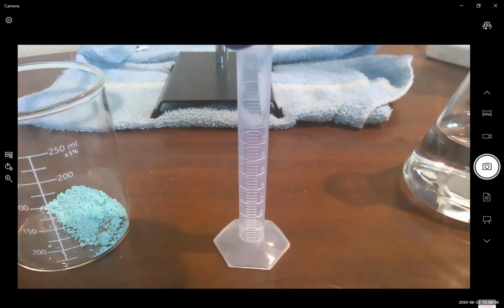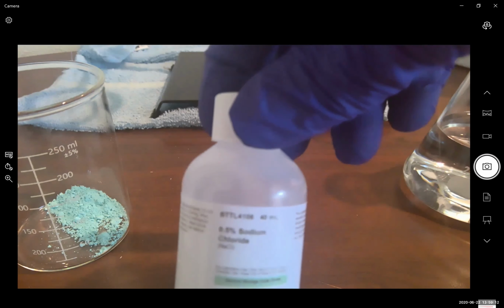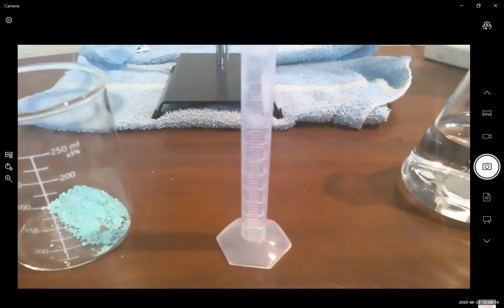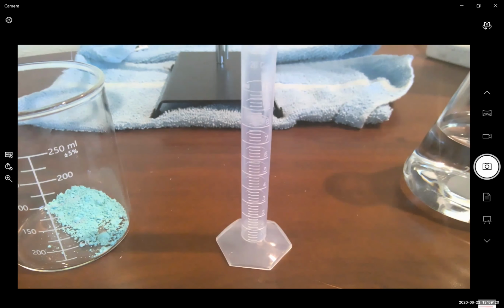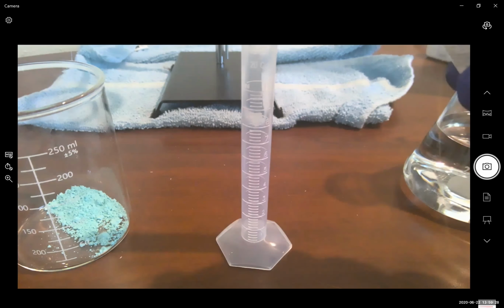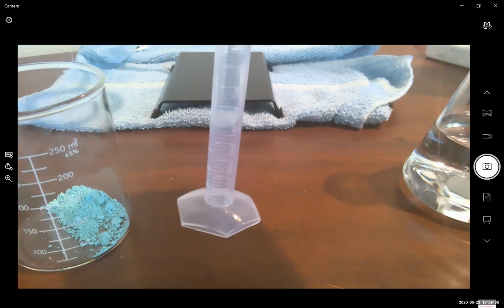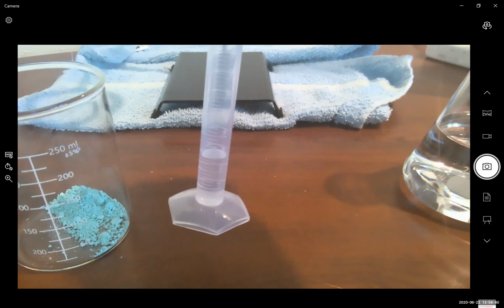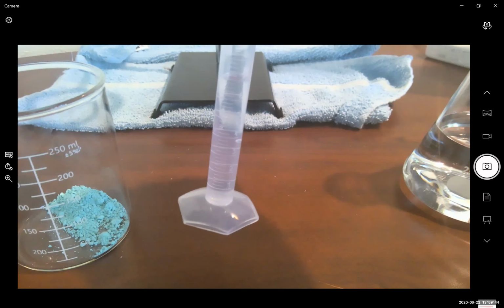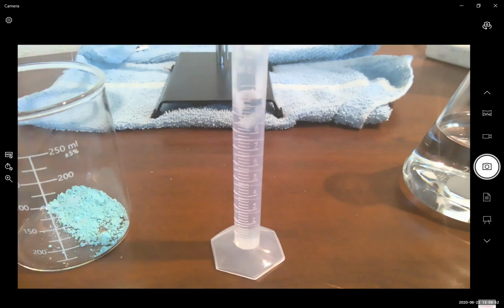Next, we're going to take a 10 milliliter graduated cylinder and fill it with our 0.5% sodium chloride. This should be in your lab box kit. Again, you're going to carefully pour. Make sure that you keep the cap secure and in your hand. It's better to undershoot than overshoot. There we go, we're about at the 10 line. It just needs to be approximately 10 milliliters of the 0.5% sodium chloride.